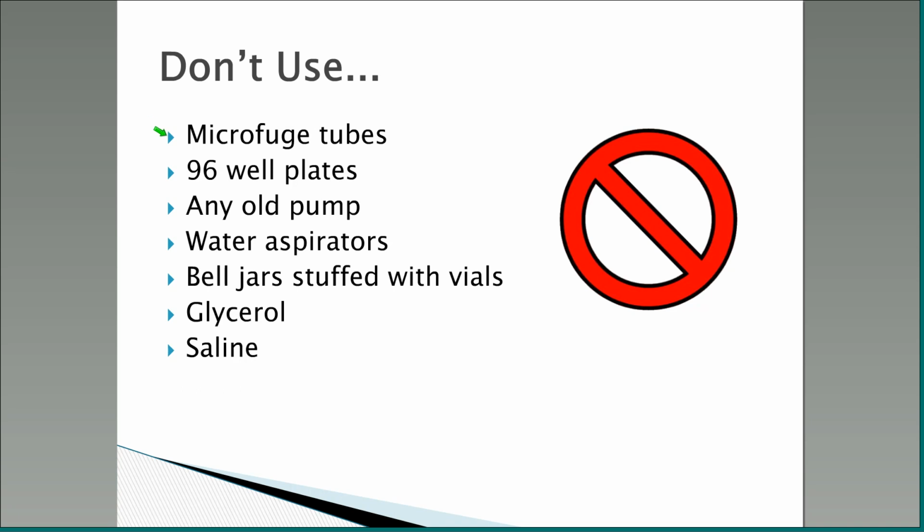The other thing is after you seal your microfuge tube, and I figured this out the hard way, which I can show you some indicator later where you can test this, water does seep across, like diffuse across plastic over time. So if you're trying to keep your samples nice and dry, plastic microfuge tubes are a bad idea. Same goes for polystyrene 96 well plates. My original product that I developed for freeze drying was just that, for 96 well plates.